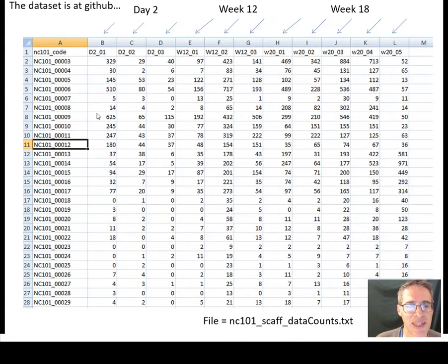So this is some gene here, right? And so we would read this as saying, in this 12-week time point from this mouse, in the fecal sample, this many reads were expressed by the E. coli that were mapped to a known gene. And this is the gene ID.